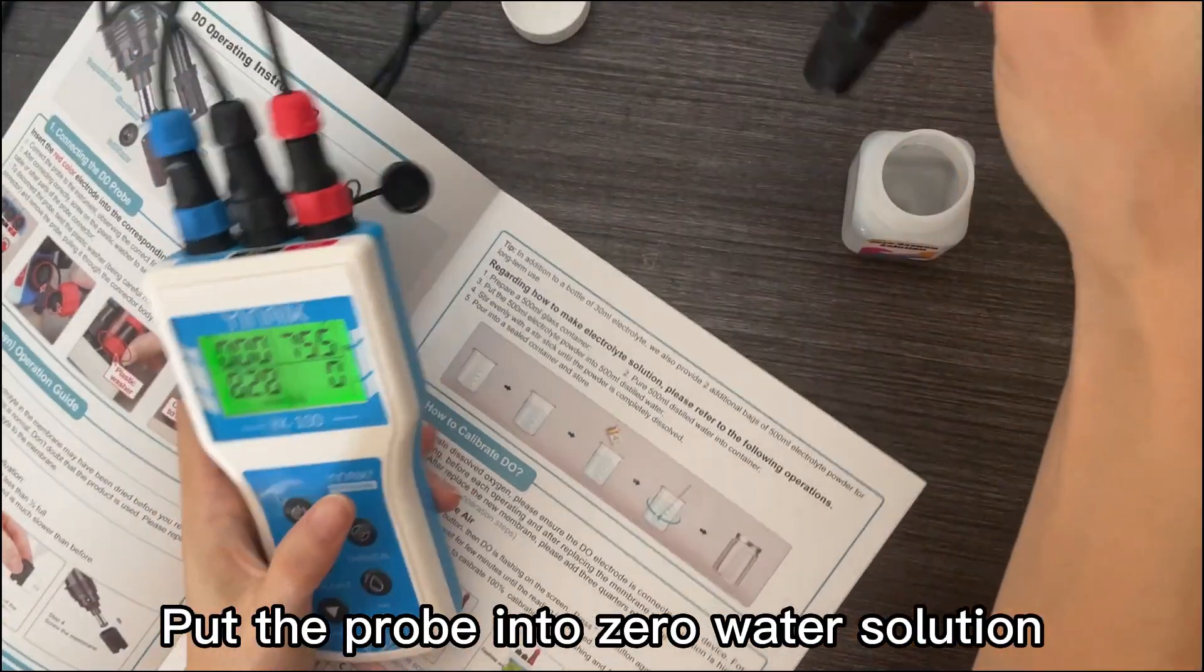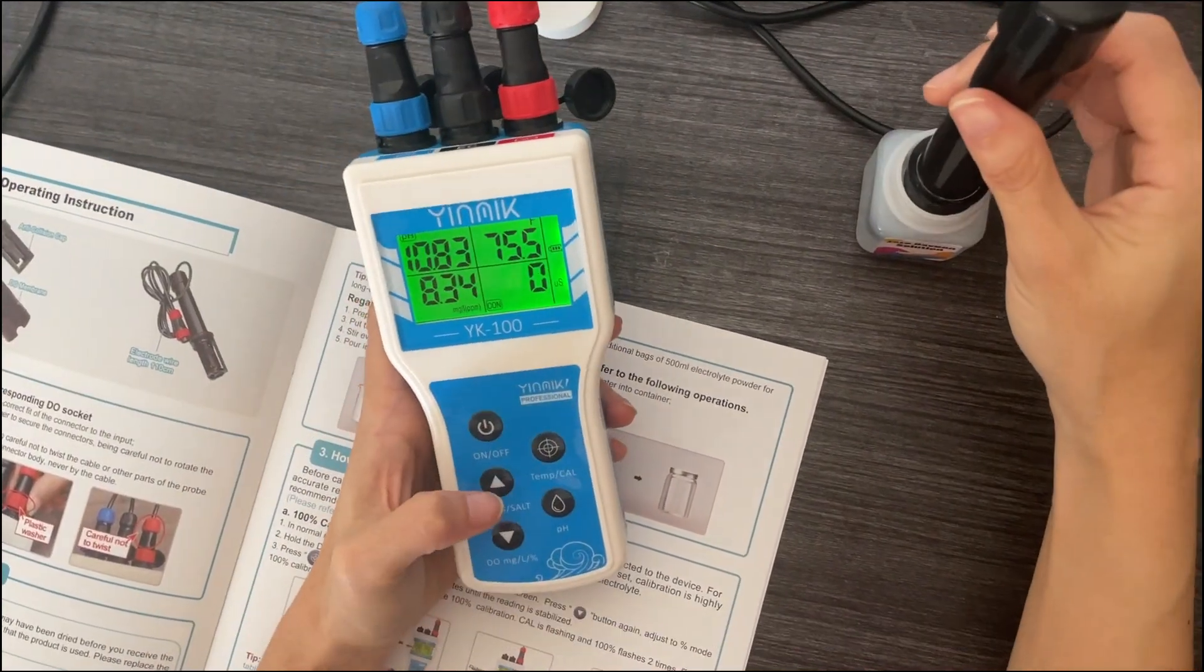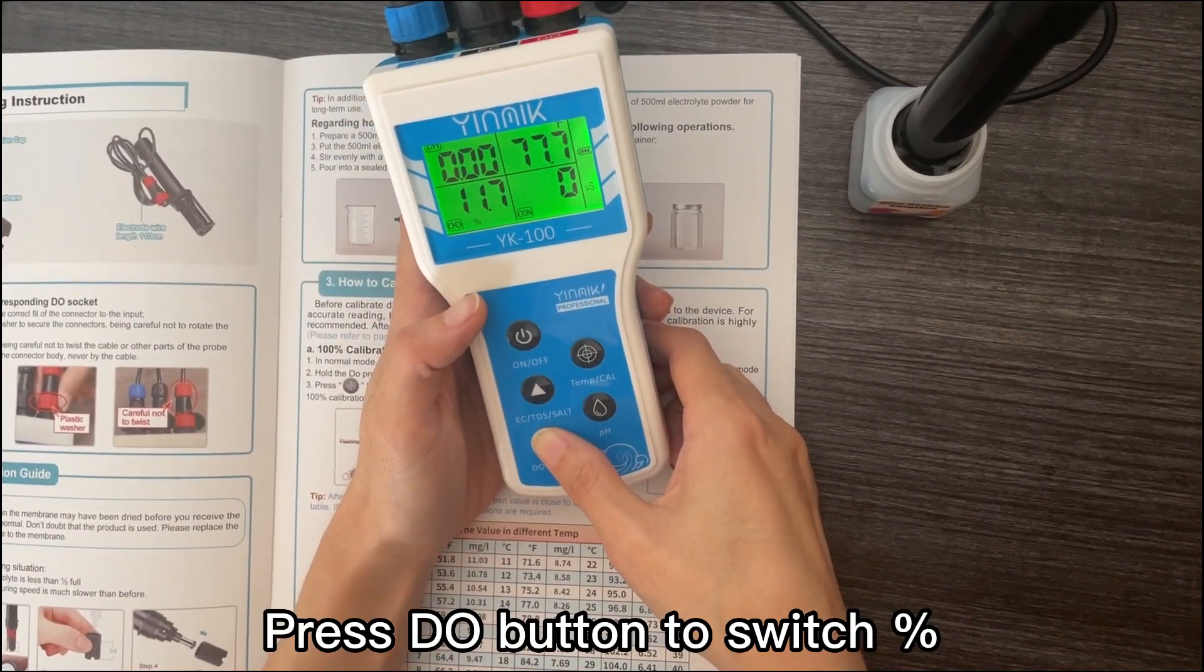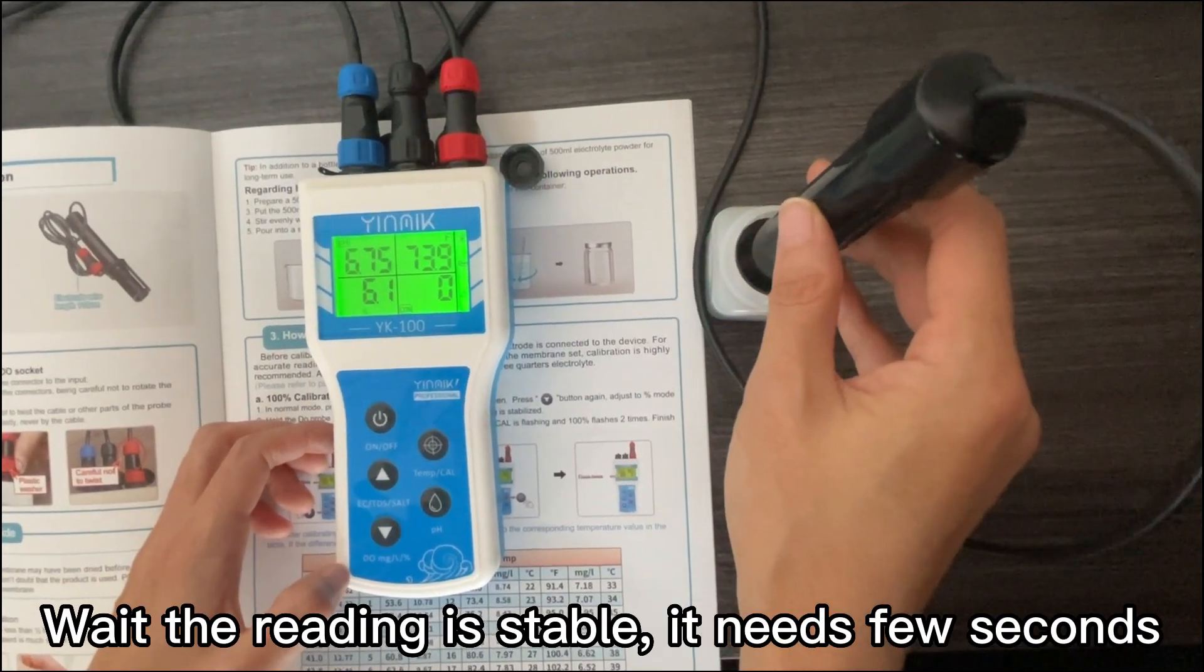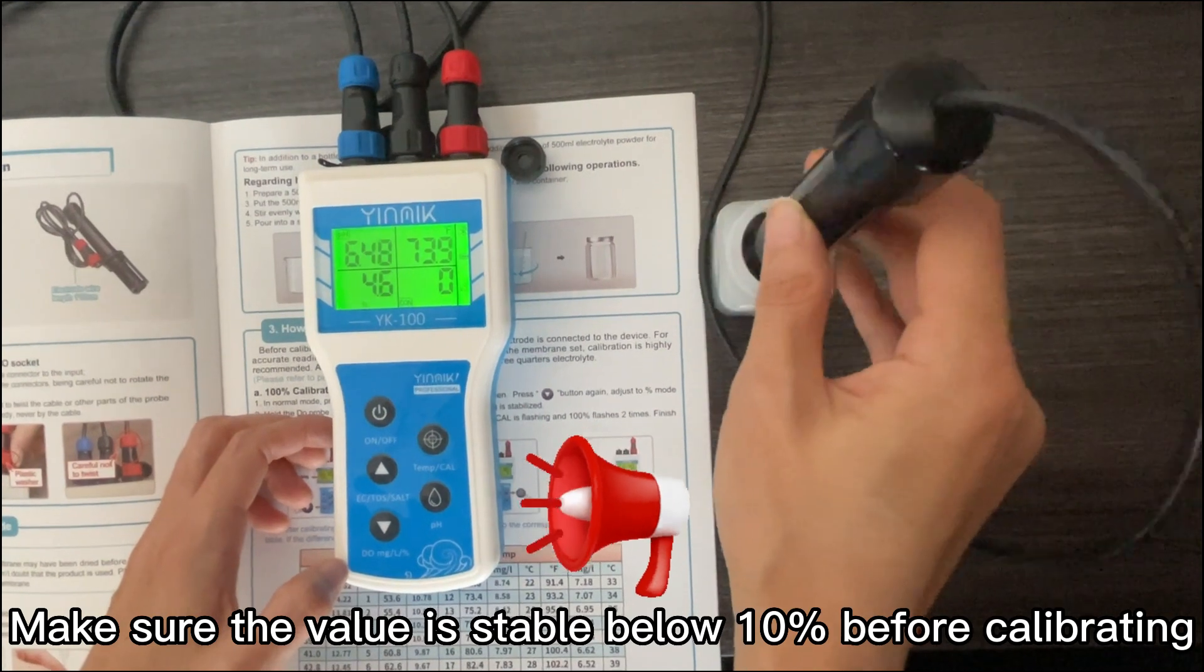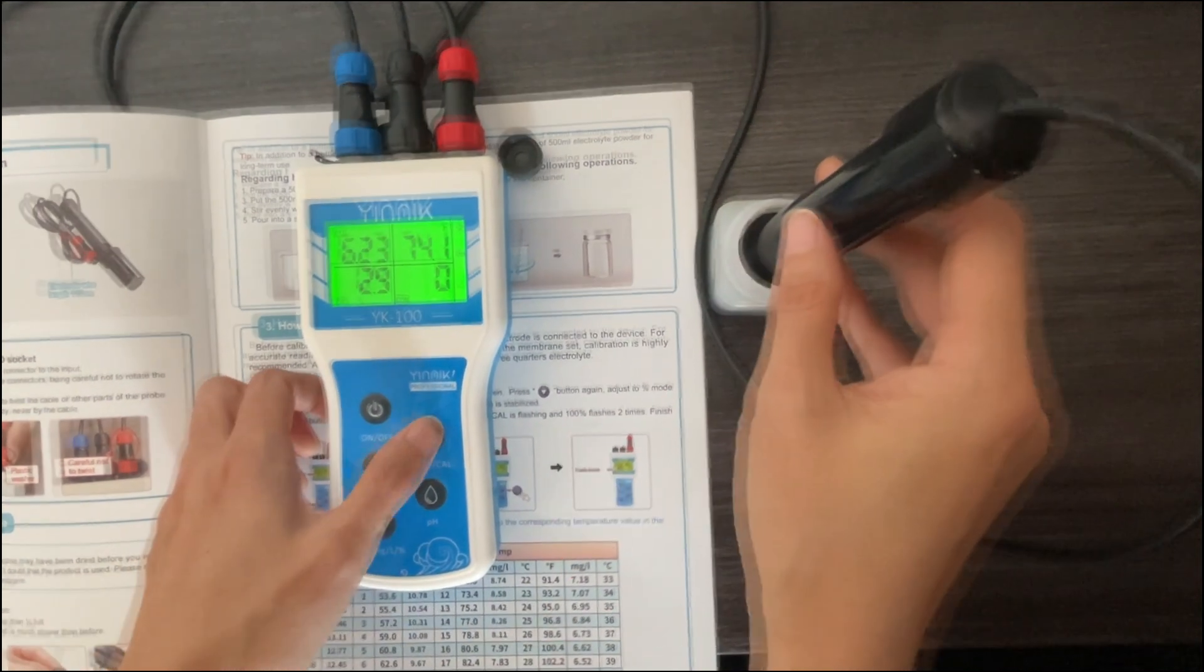Put the probe into zero water solution. Press DO button to switch to percent. Wait until the reading is stable. It needs a few seconds. Make sure the value is stable before calibrating.